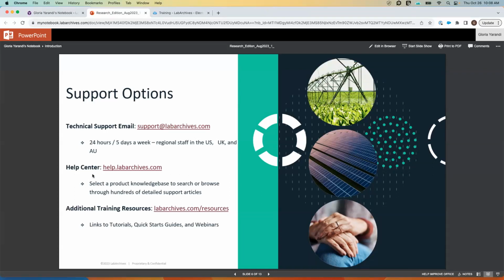We have our help center, which includes our knowledge base, which is accessible with any product you have, like the ELN for research, for example, and includes over 100 detailed support articles to assist you when you're using the notebook. We also have additional training resources such as our webinars, our video tutorials, and our quick start guides available on our local support page.